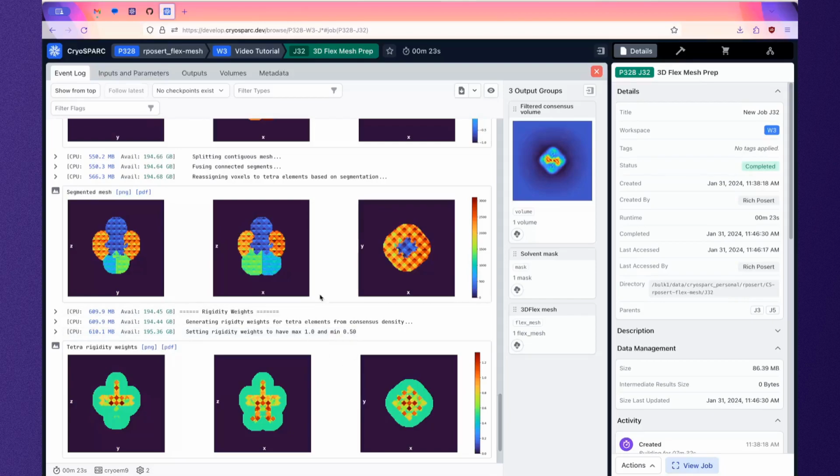So in this case, we definitely want the fab and ion channel segments to be fused together at their border so that the fabs don't float away. But we also talked a lot about how if we impose rigidity on the micelle, it becomes challenging to ensure that our transmembrane domain is still allowed to flex in the way that we know it does based on our 3D variability results. As always, there are a lot more figures and written discussion of these interesting topics in the guide, and the discussion forum remains a valuable resource if you have any additional questions after watching this video. Good luck generating your 3D flexible refinement meshes.